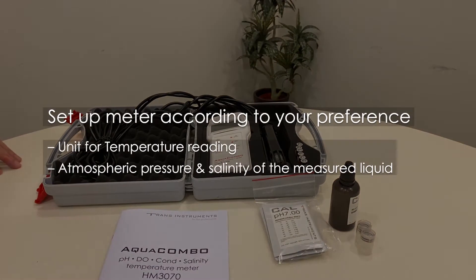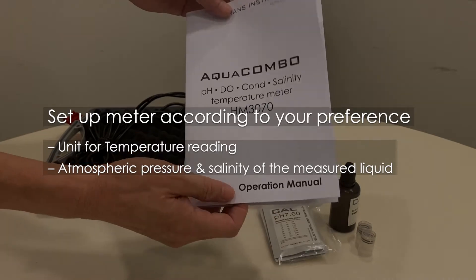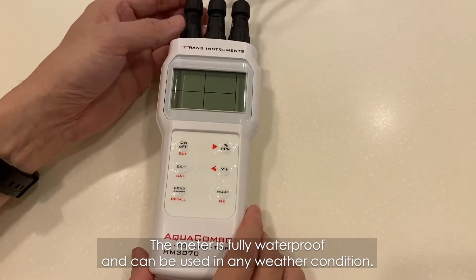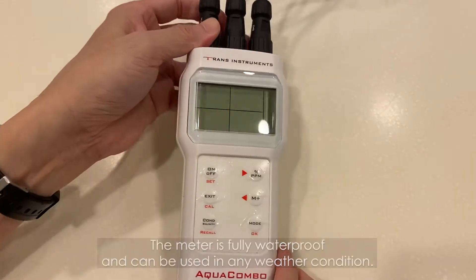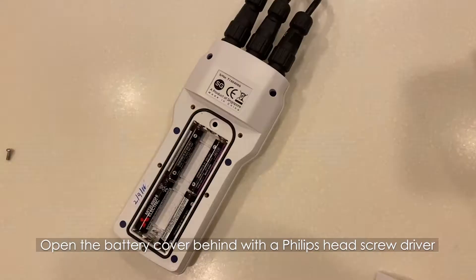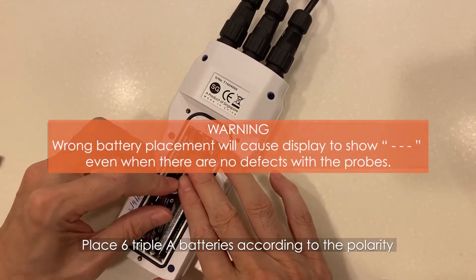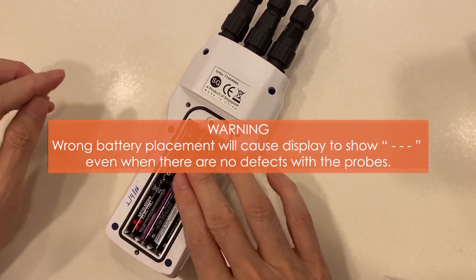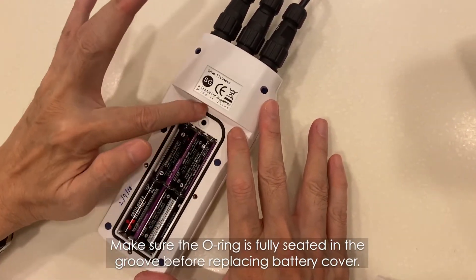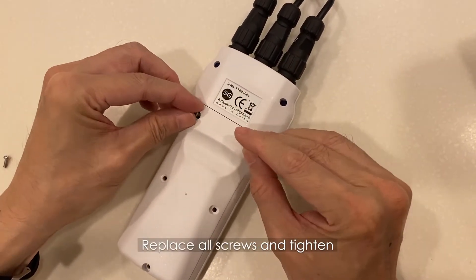Set up the meter according to your preference. The meter is fully waterproof and can be used in any weather condition. Open the battery cover behind with a Phillips head screwdriver. Place six AAA batteries according to the polarity. Make sure the O-ring is fully seated in the groove before replacing the battery cover. Replace all screws and tighten.